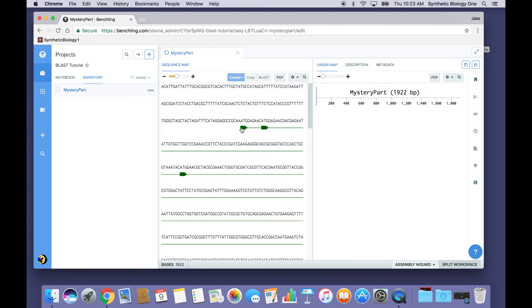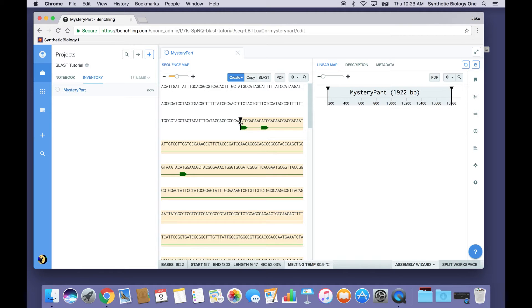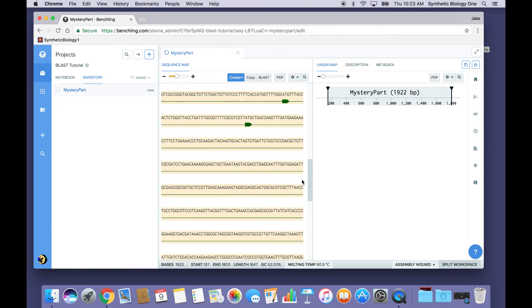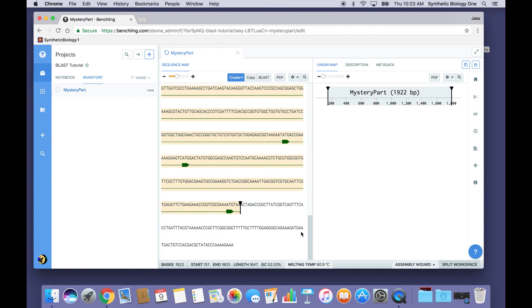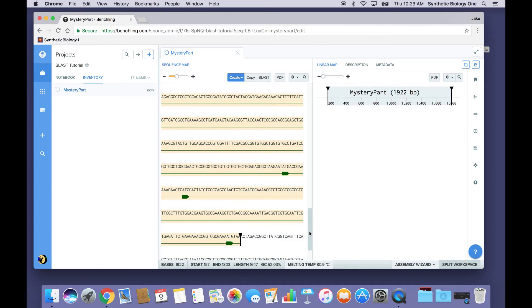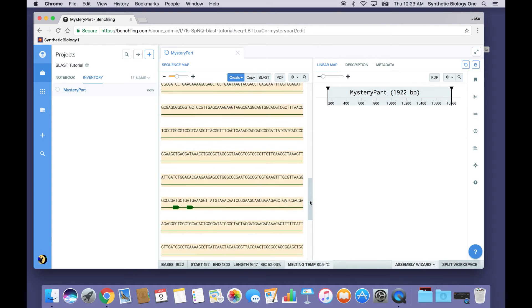I can click on any one of these, and as you'll see, they start with a start codon, like ATG. Scrolling down to the end, they stop with a stop codon, in this case TAA, and they've got some meat in between.